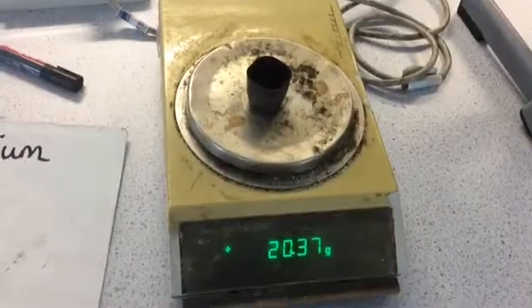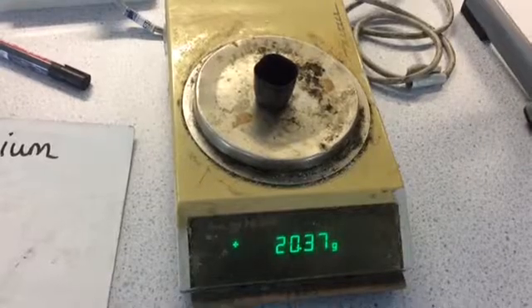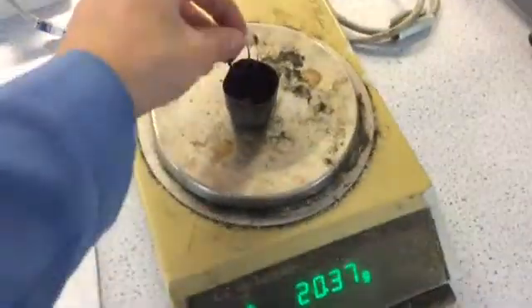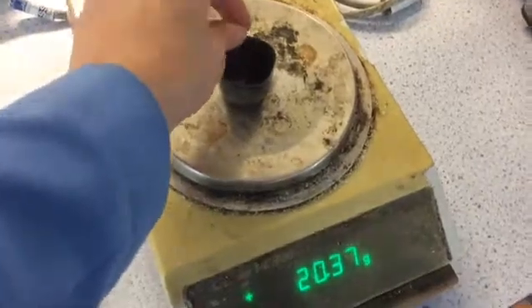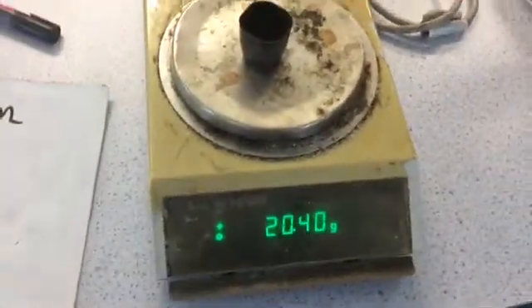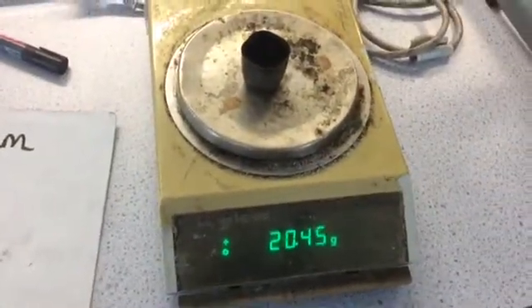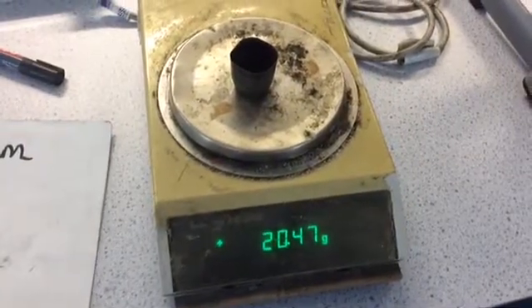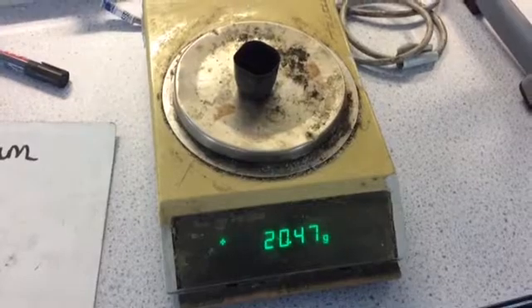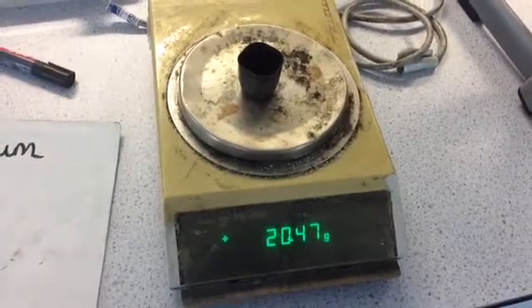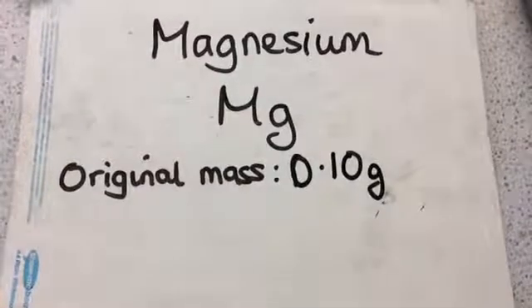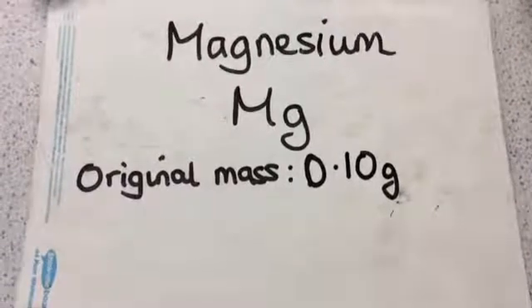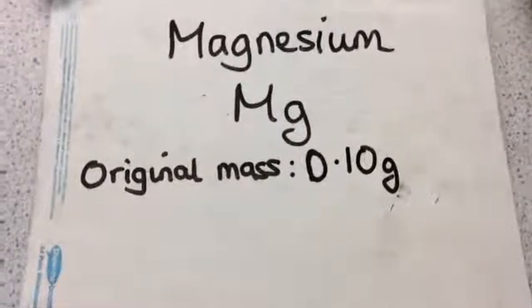So I've put a crucible onto the balance and it has a mass of 20.37 grams. I'm going to now put my magnesium which I've just rolled up loosely in and I can see that my mass is going up and it's settled at 20.47 grams.